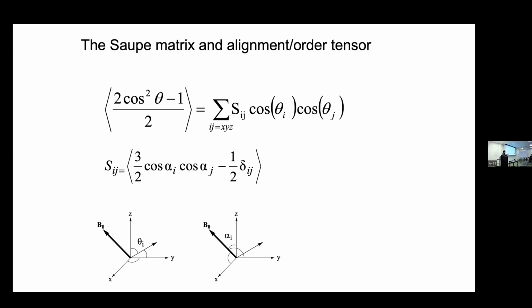Well, I'm taking it to a different rabbit hole. Imagine I take the spectrum, and there are differences in the chemical shifts. But the truth is, there is no interaction with the medium. Why would there be differences in chemical shifts? I'm giving you a hypothetical. The RNA does not interact with the ordering medium. It's a fact. But that doesn't mean that my chemical shifts are going to be perfect. Why would they not be perfect?